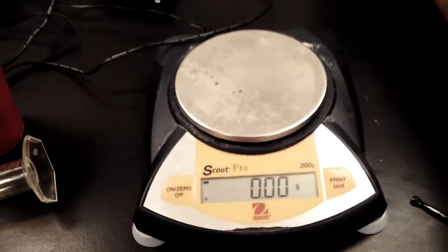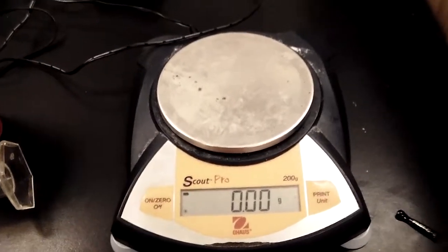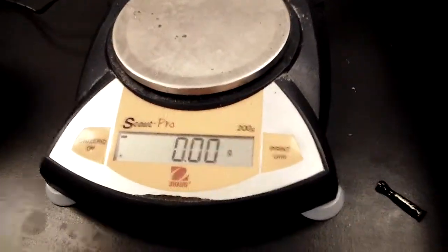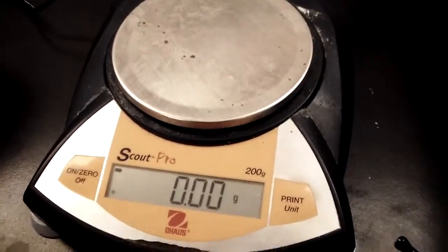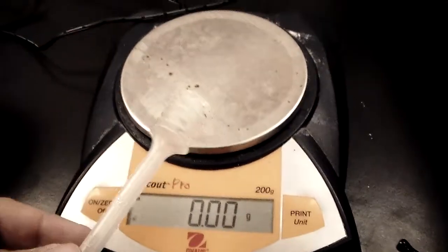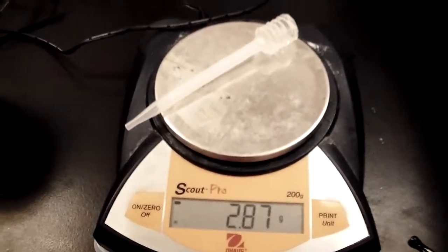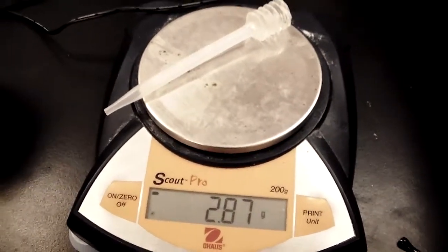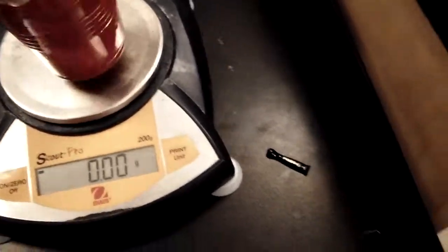Here it is, and you need this to weigh stuff. The first thing you want to do is make sure your balance is on zero. Then take whatever object you're weighing — in this case I'm going to use a dropper — put it on, and it says 2.87 grams. That's the mass of the object.